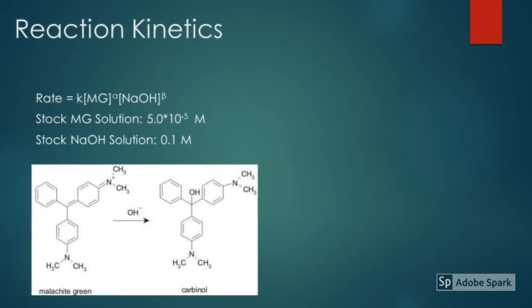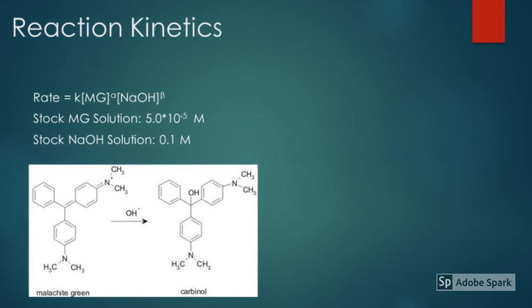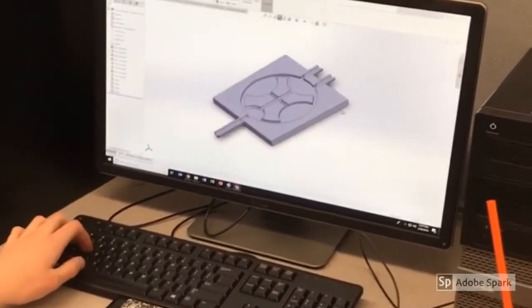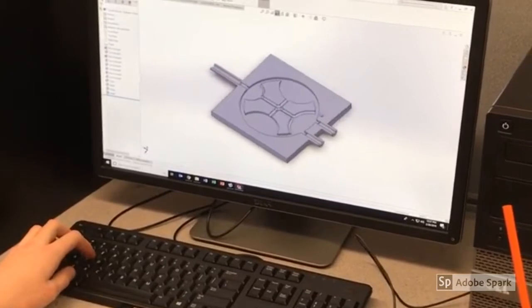A spectrophotometer was used to measure the transmissivity of light through the solution exiting the reactor, which could ultimately be used to calculate conversions. As previously stated, all reactors were initially designed in SolidWorks. These 3 reactors varied in total volume and potential flow pattern.